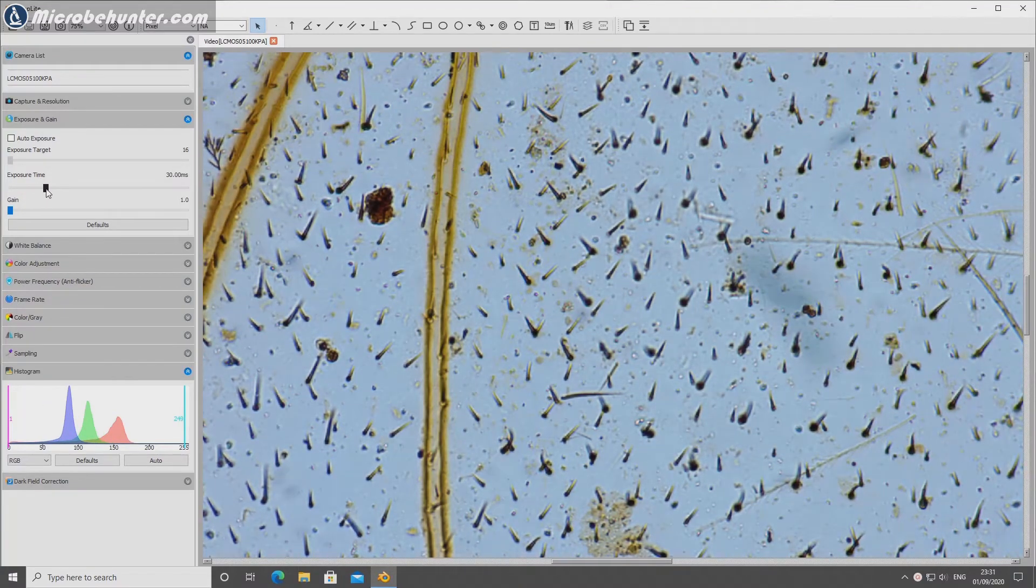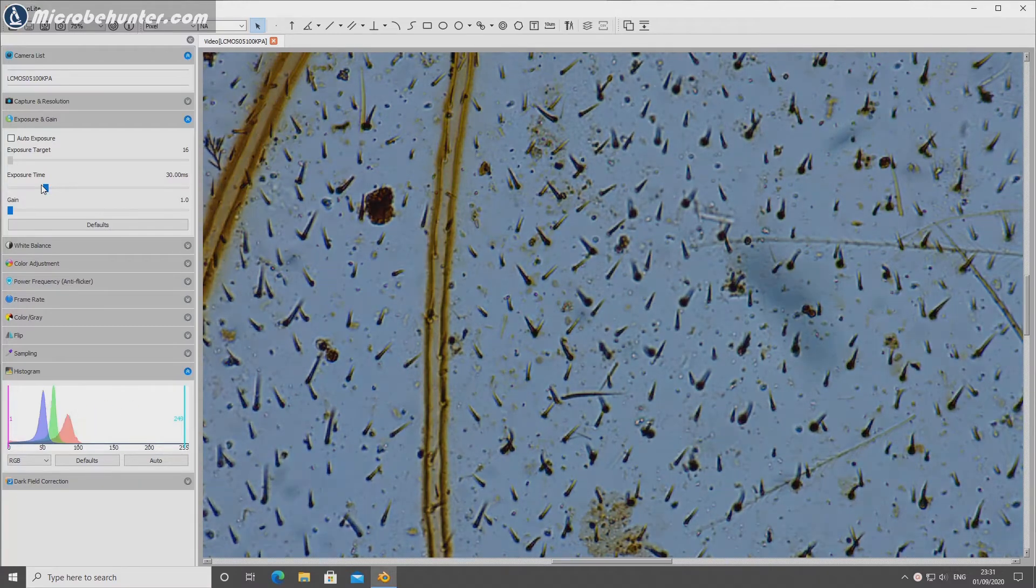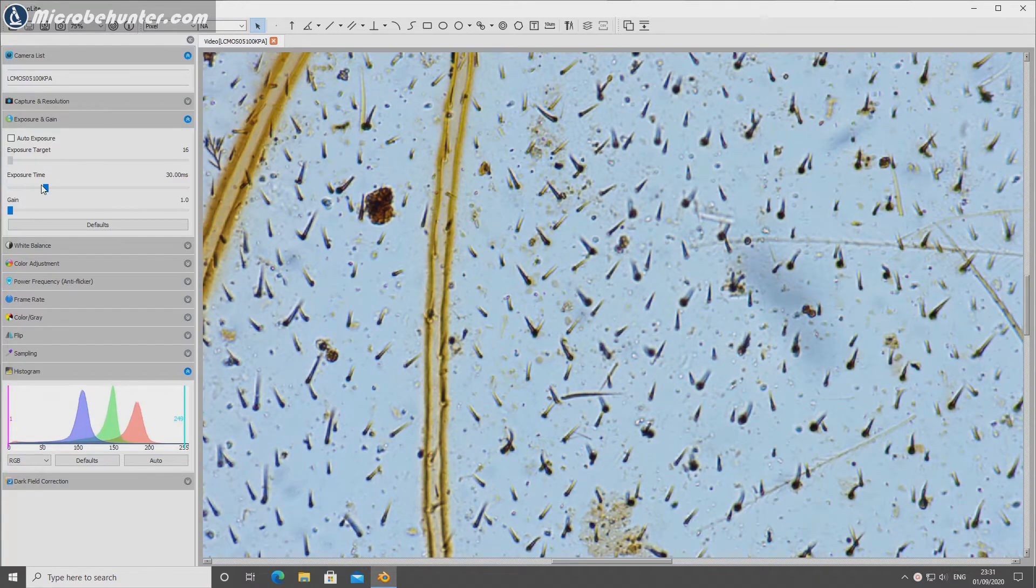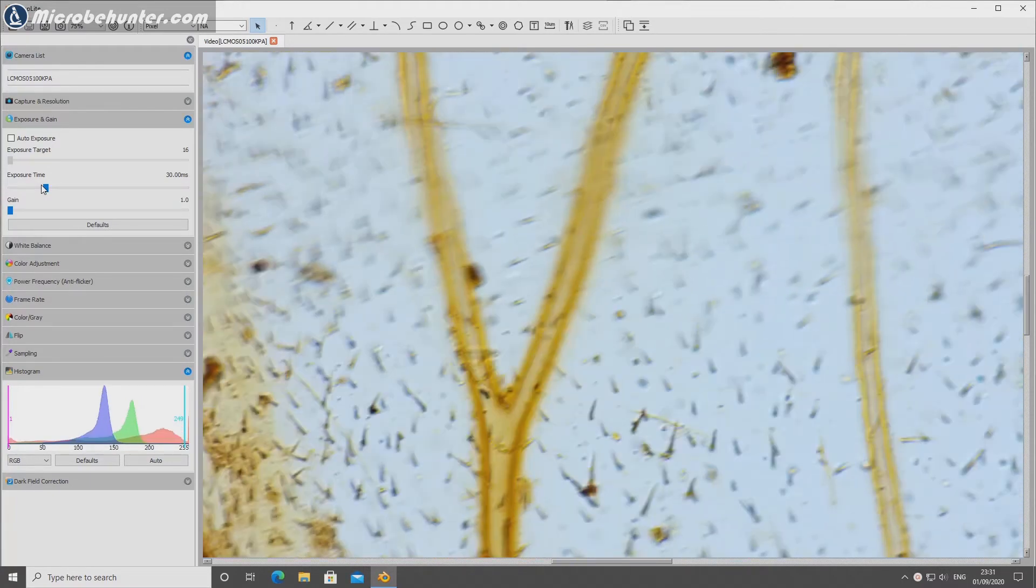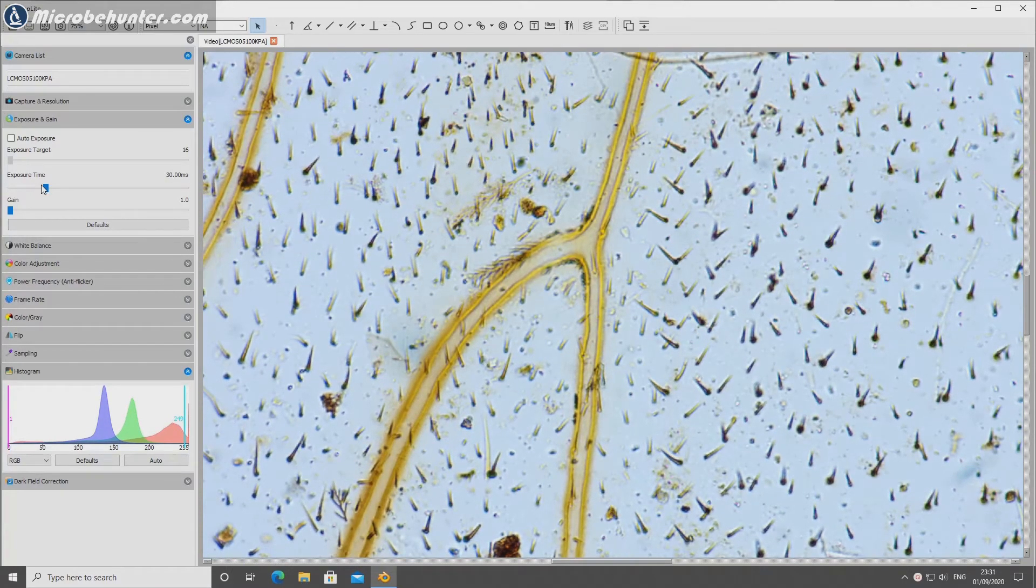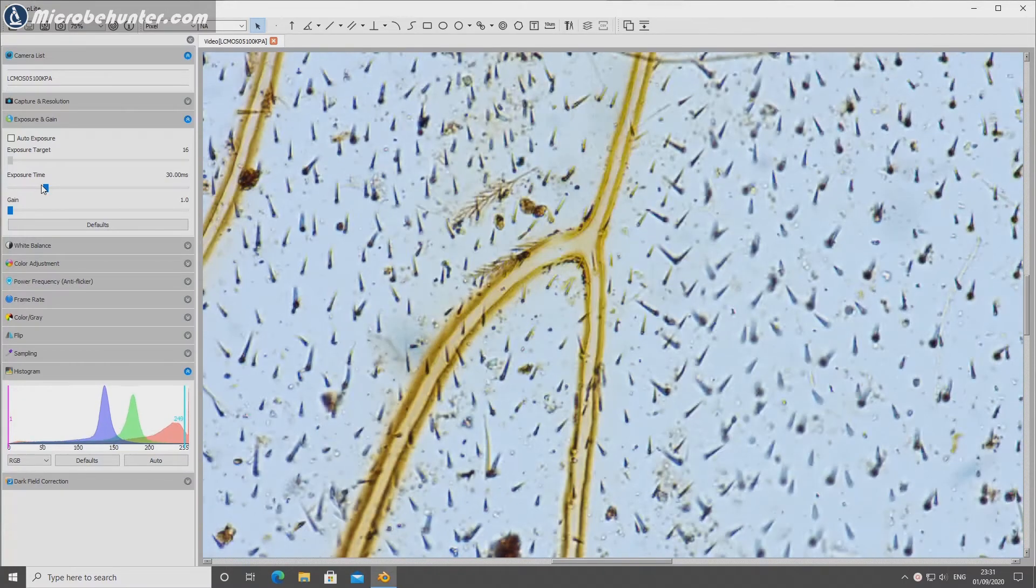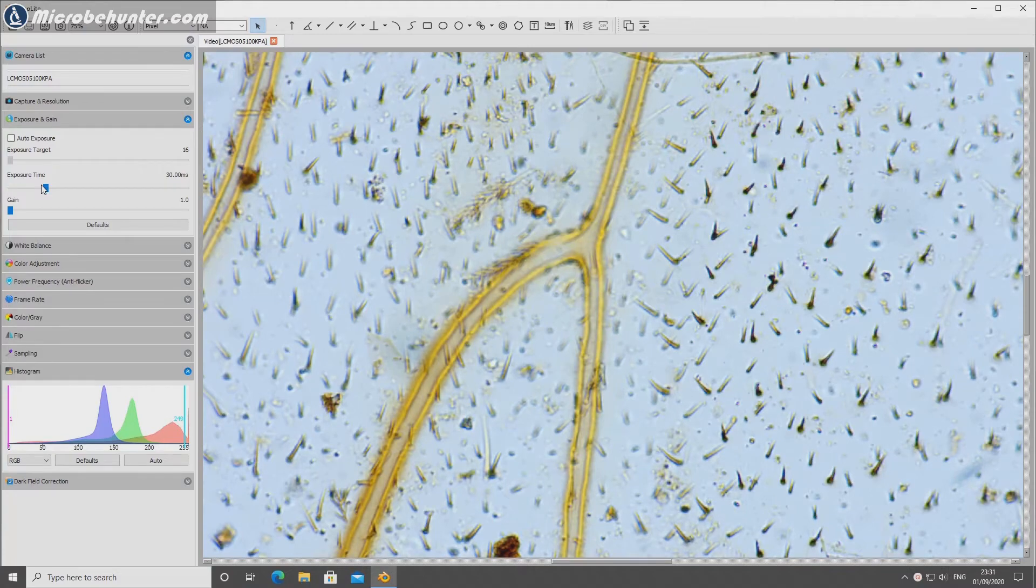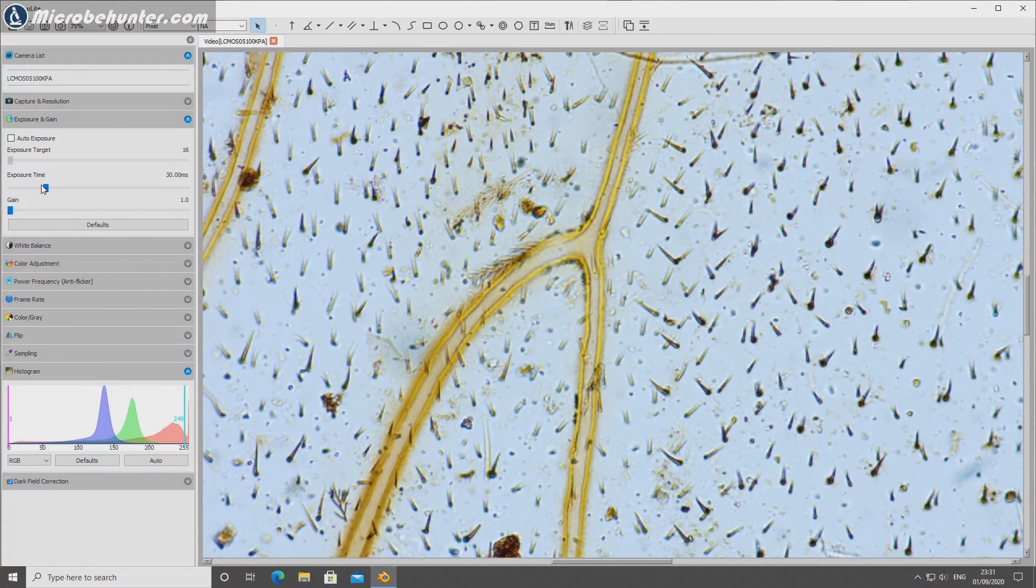Of course I have to make everything a little bit brighter because when you go up with the magnification the image becomes darker. It works quite nicely, you can see the individual hairs of the wing of the bee, the vessels and veins of the bee which give the wing structure and strength.